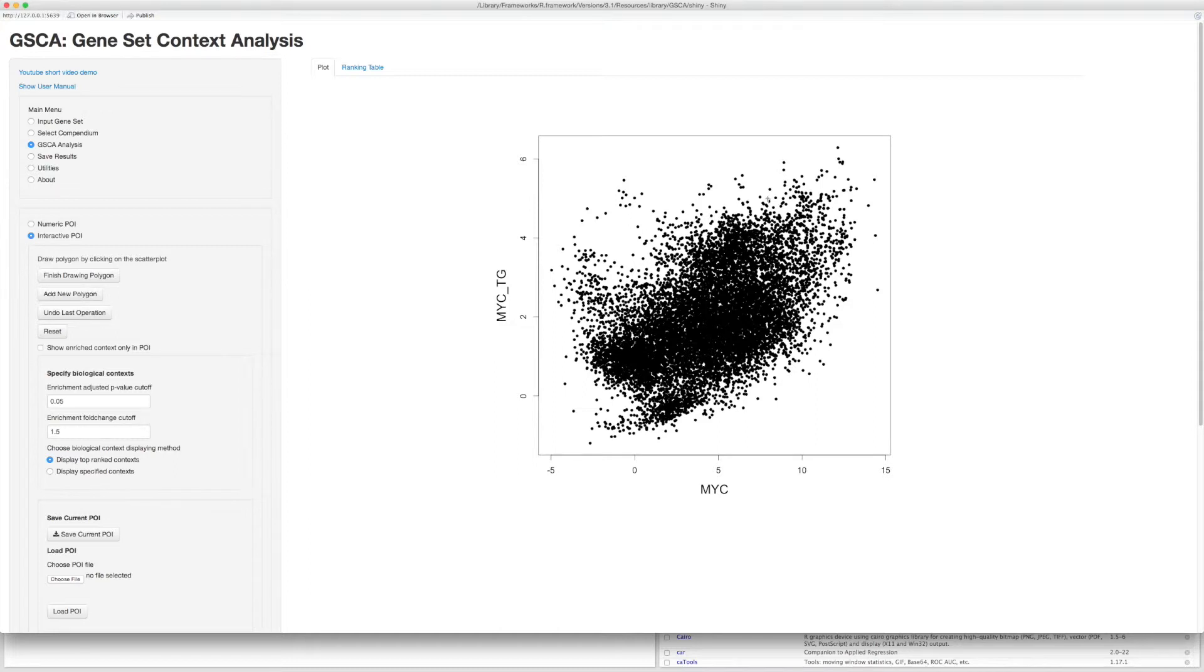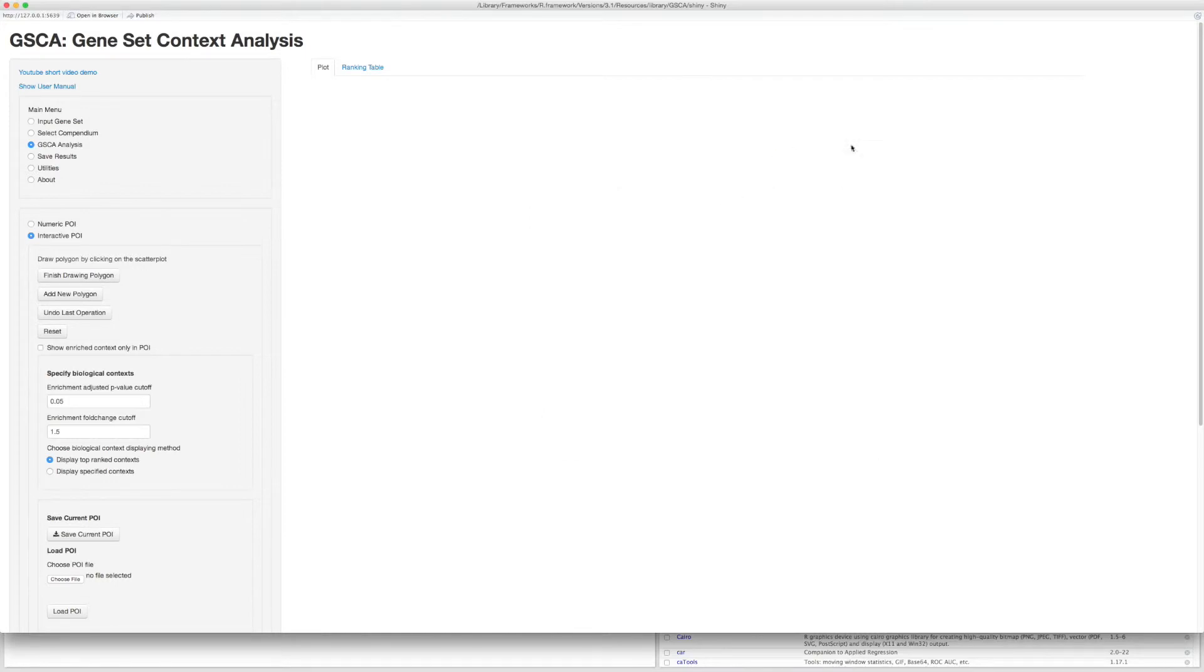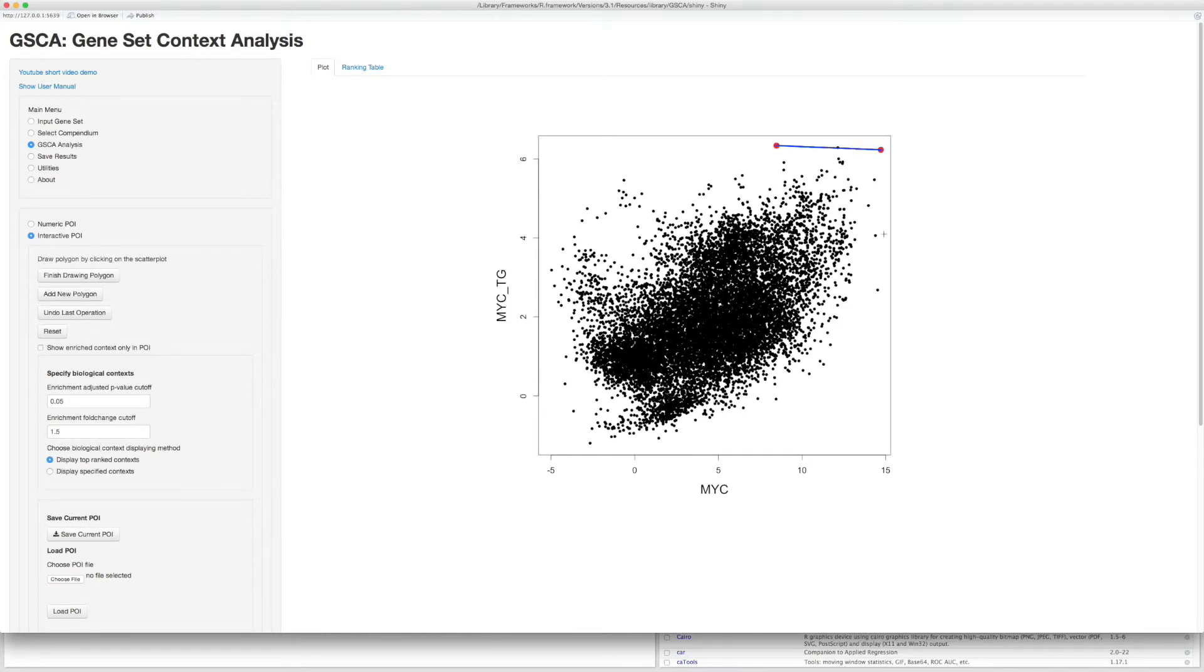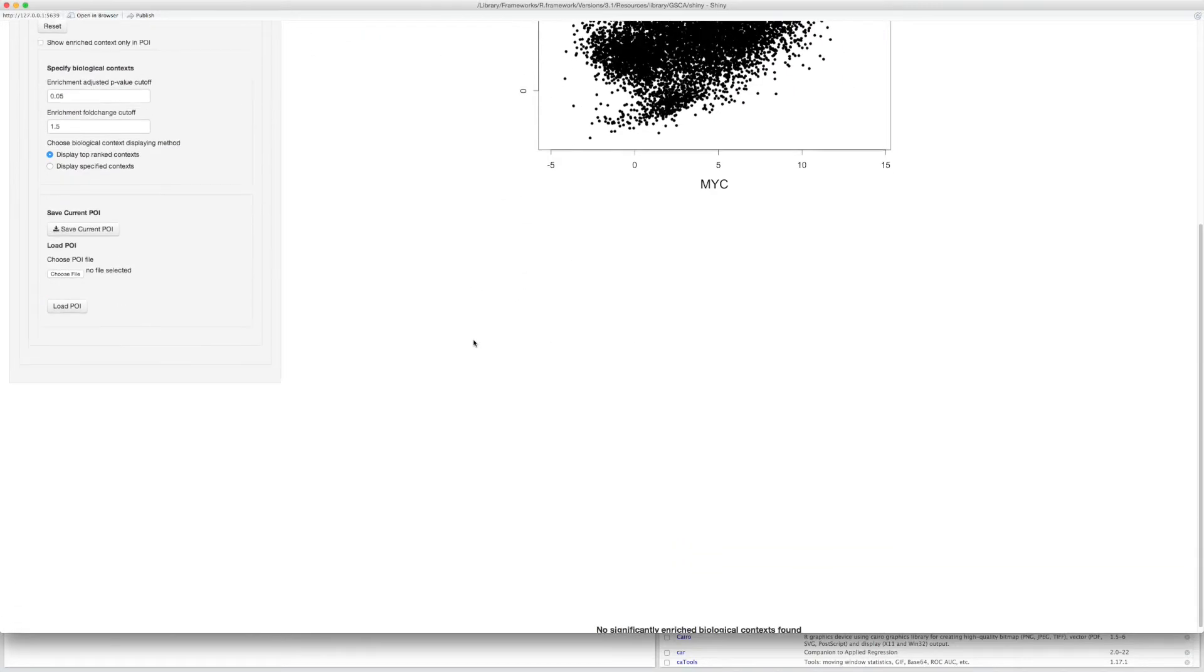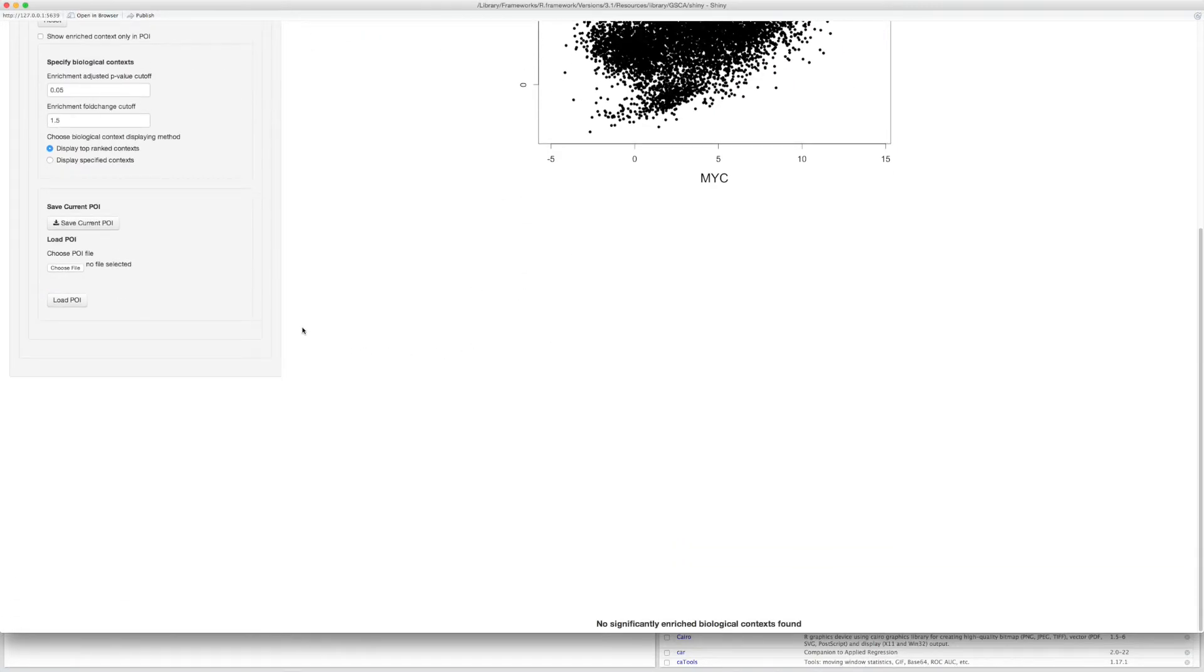A very important feature of GSCA is that users can conveniently save and reload POI to reproduce the analysis. For example, after drawing a polygon here, you can click Save Current POI button to save the POI on your local computer.